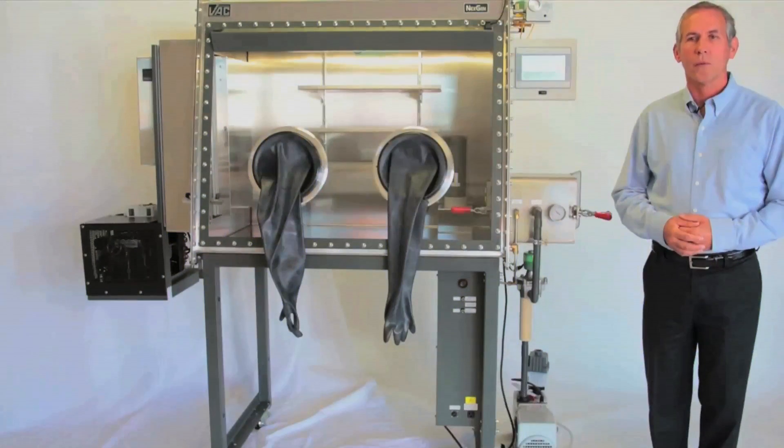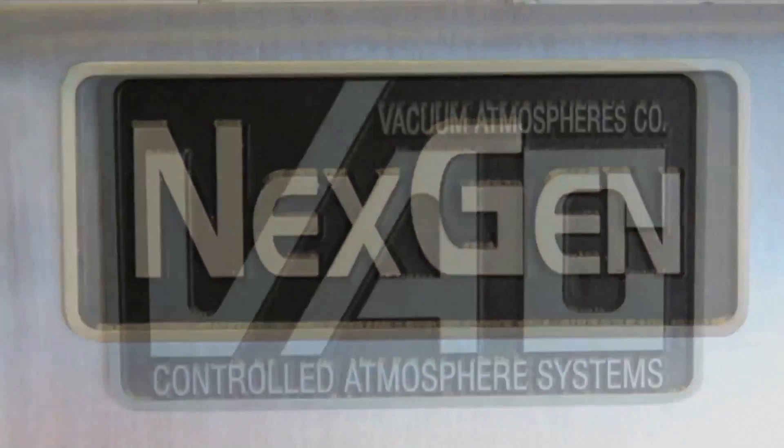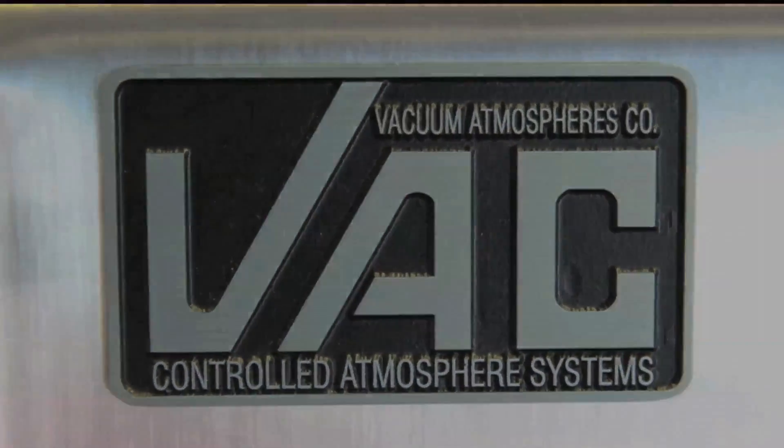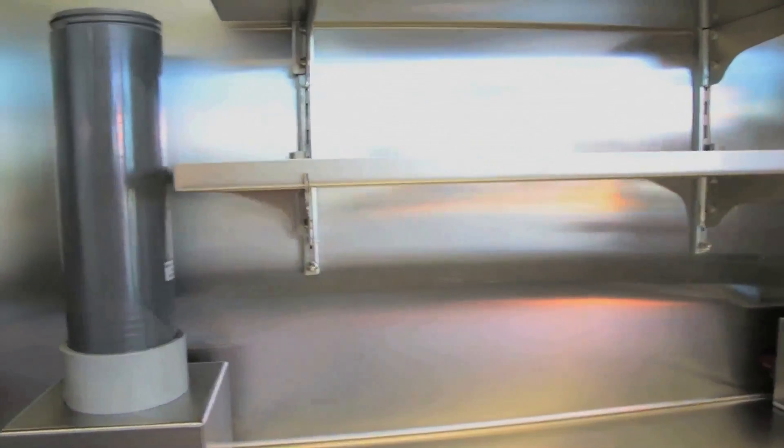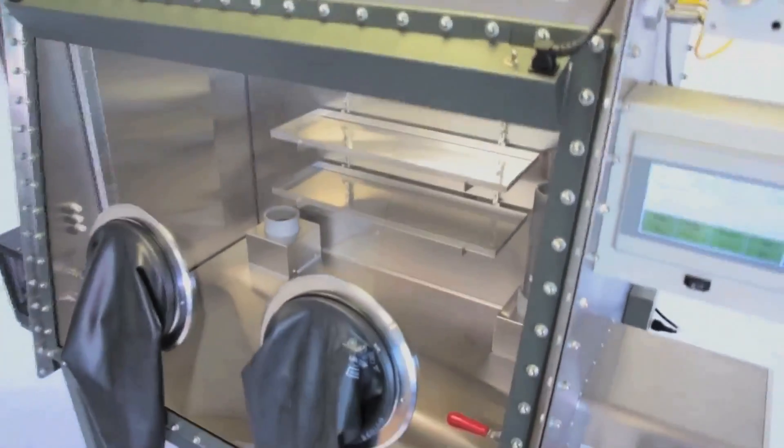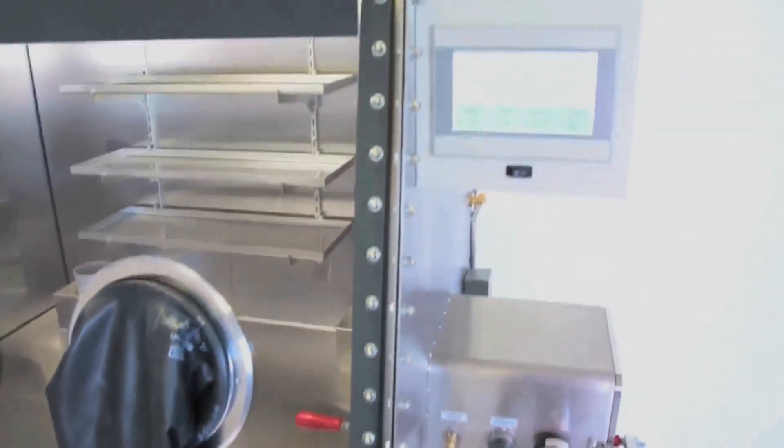Hi, I'm Will with Vacuum Atmospheres. We're very excited to introduce our new NextGen glove box system, which uses our innovative inert gas purifier design with replaceable purifier cartridges. NextGen integrates our Genesis cartridge concept with our full-featured Nexus control system.